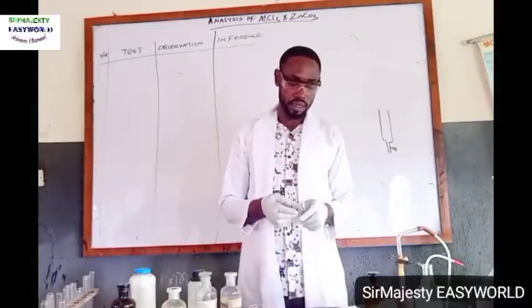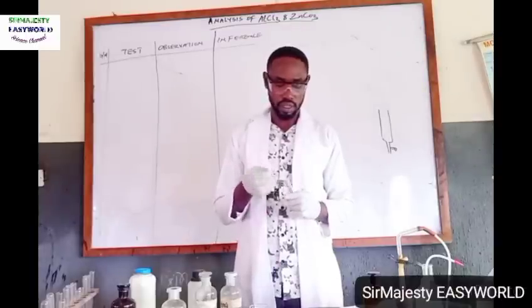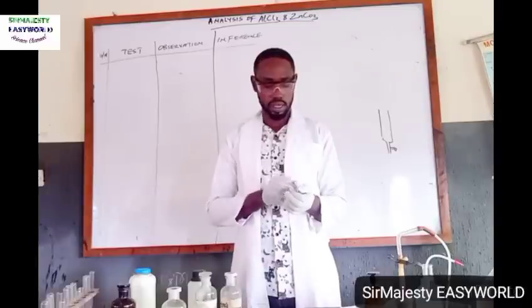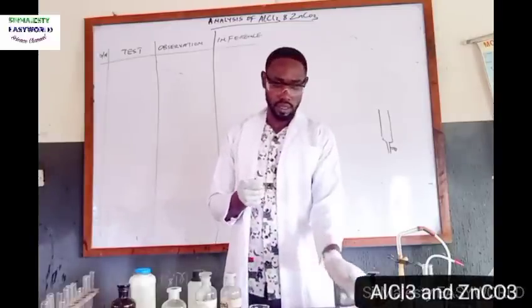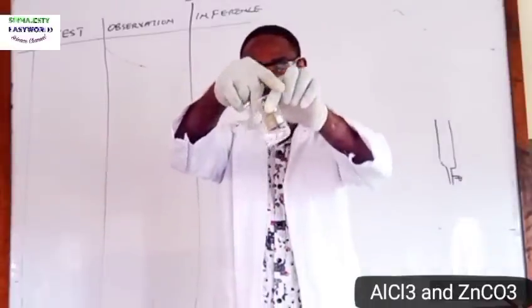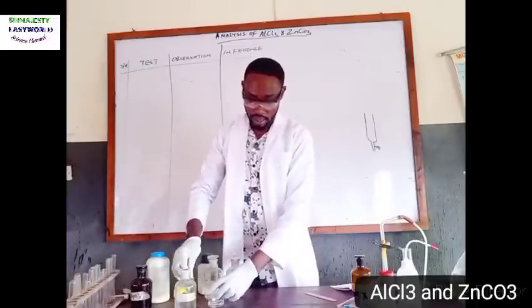That's the aluminium chloride, and also test with litmus. So I'm going to test with litmus. Definitely I want to use blue because I already told you that aluminium chloride can also be called Lewis acid. It's an acid according to Lewis. So this is the solution of Y. I'm now putting blue litmus. So you see it turns blue litmus paper red, and we have concluded the first step.